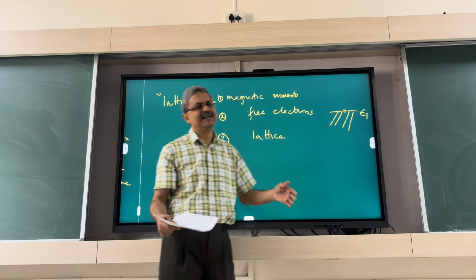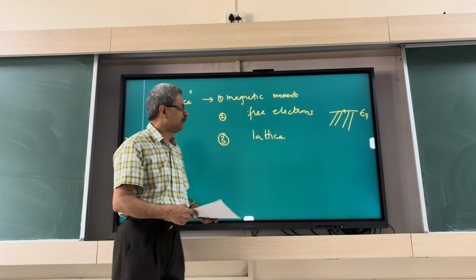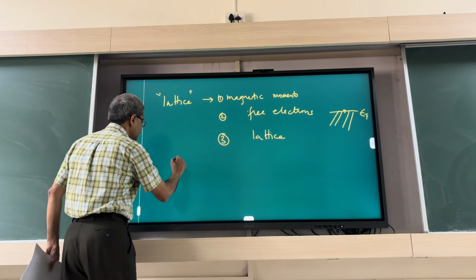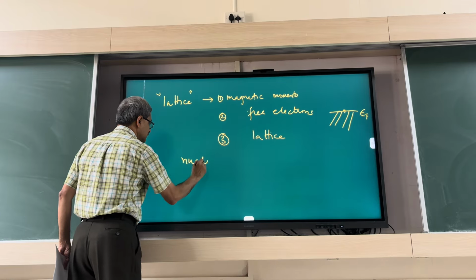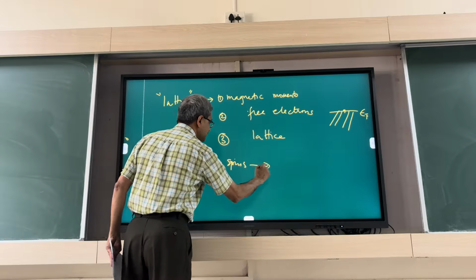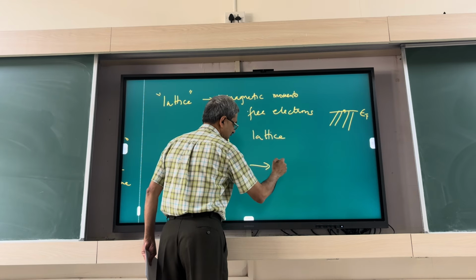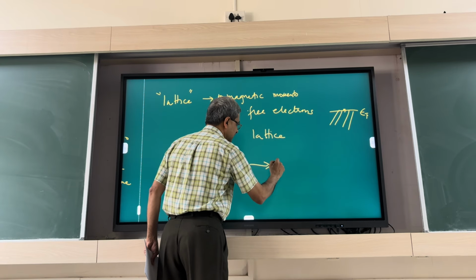That's not something you measure or monitor all the time, but the relaxation is energy from nuclear spins going to the so-called lattice, which could be just magnetic excitations.